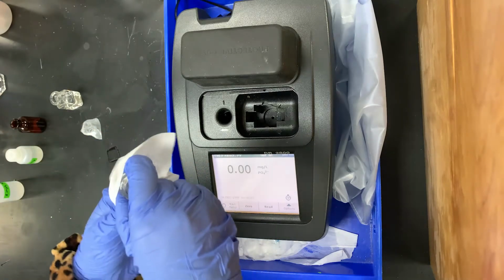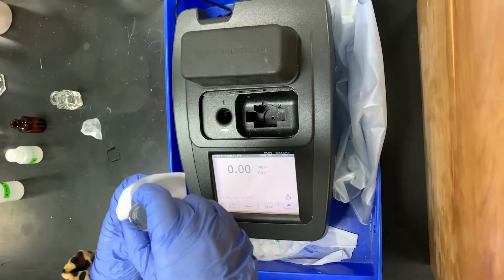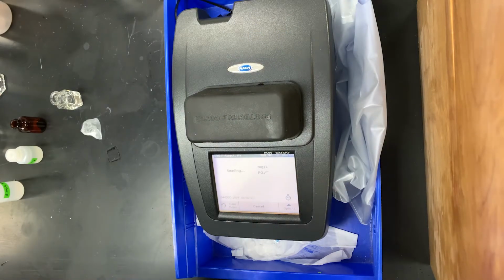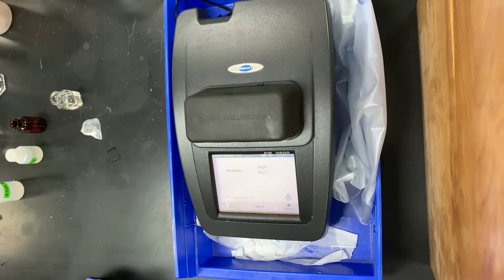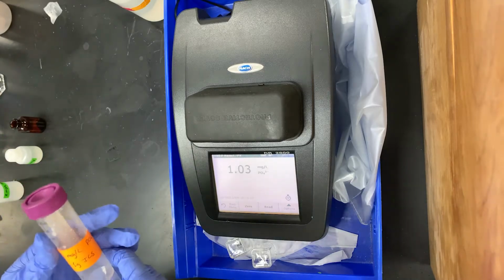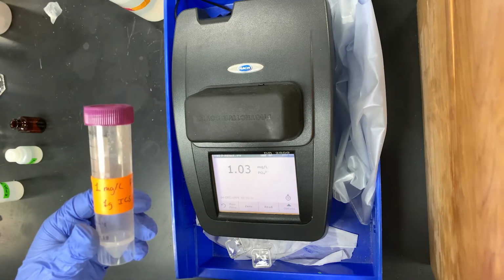Again, this method can only do up to 2.5 milligrams per liter of phosphate. So if we were doing, let's say, our 10 milligram per liter standard, we would have to dilute it down about 10 times for it to fall within the range. I'll press read for the sample, and we're getting a reading of about 1.03 milligrams per liter of phosphate. Now that we've verified our initial concentration for our 1 milligram per liter solution of phosphate, we can move on to the adsorption isotherm.